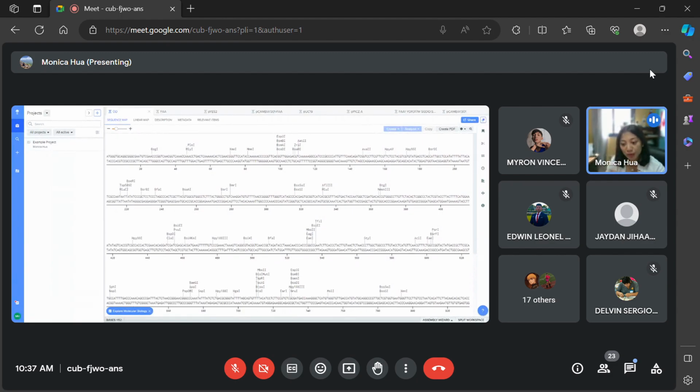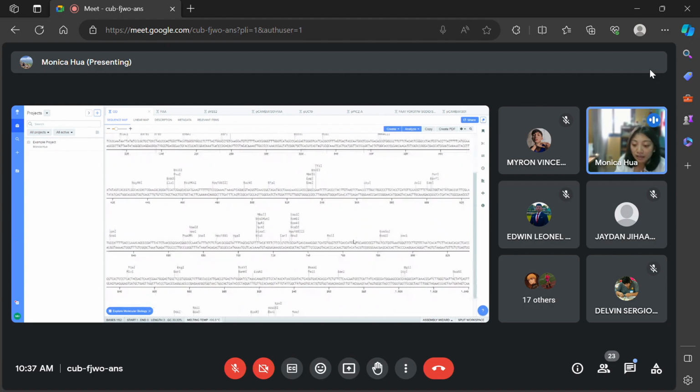I usually just use my hands because sometimes I would like to insert certain sequences for better replication and transcription. For me, I prefer using my hands, but this program makes it easier if you prefer to use it, right?